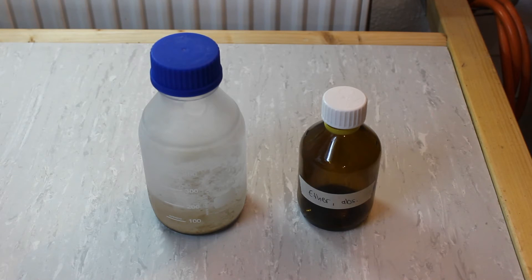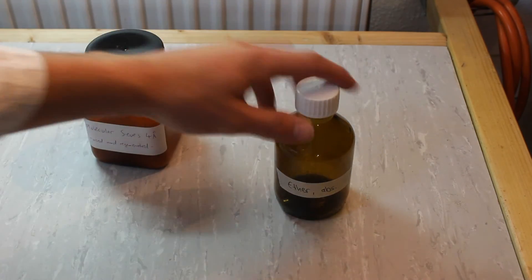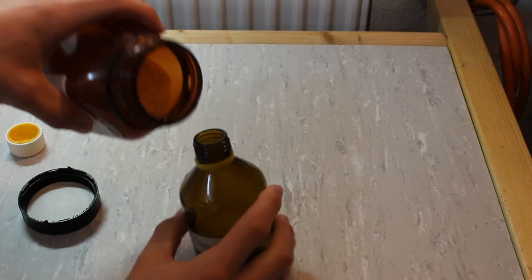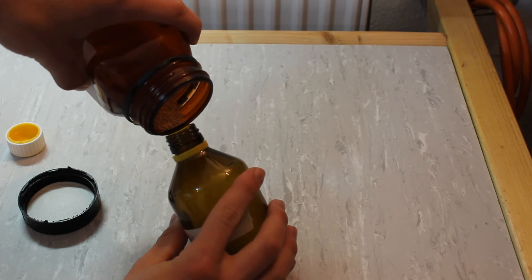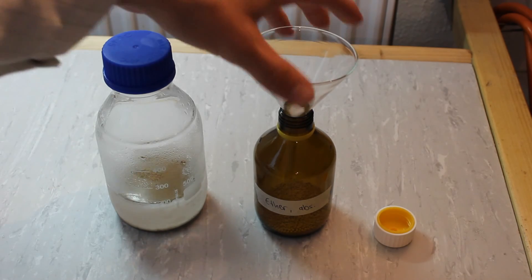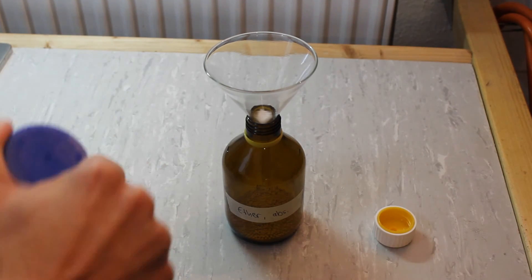The ether has been sitting over some molecular sieves in the freezer for 3 days now, so it's time to transfer it into a storage bottle. First I'll add some fresh molecular sieves to the storage bottle so our ether remains dry. I plugged the filter with a little cotton ball so our molecular sieves remain in the filter. With that in place, let's transfer our diethyl ether.